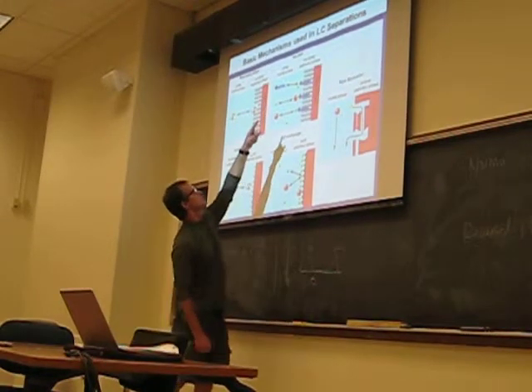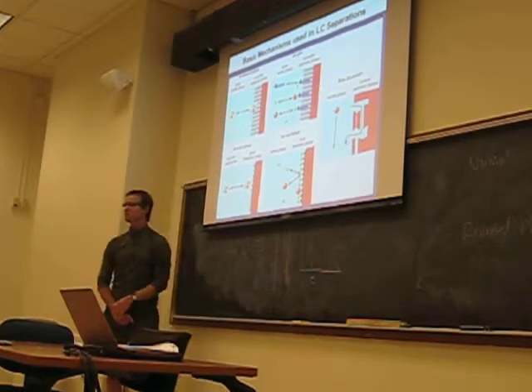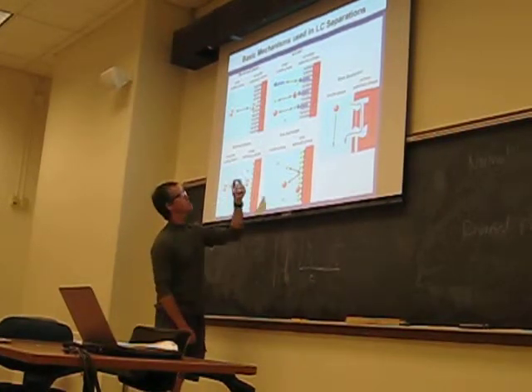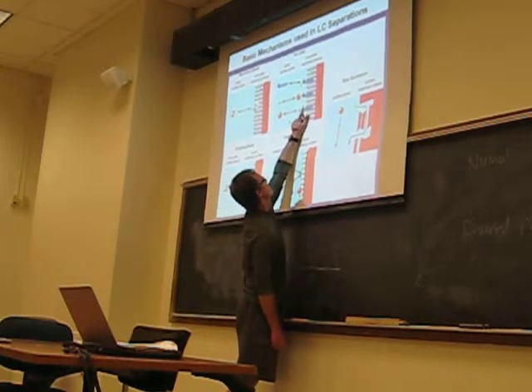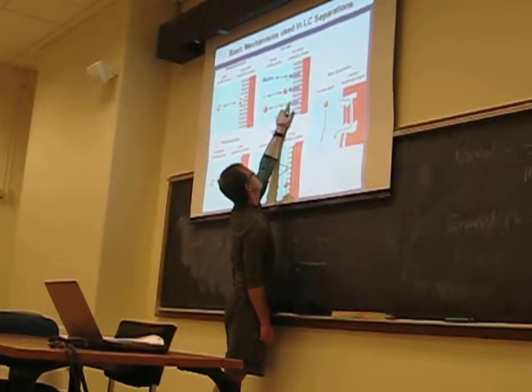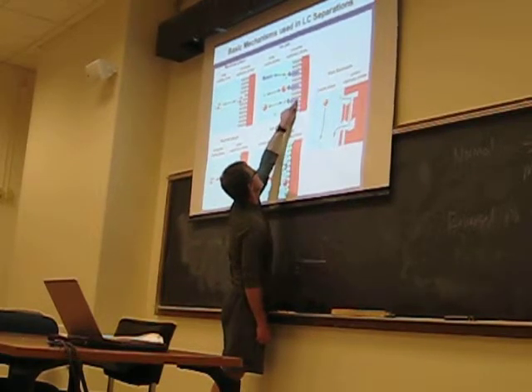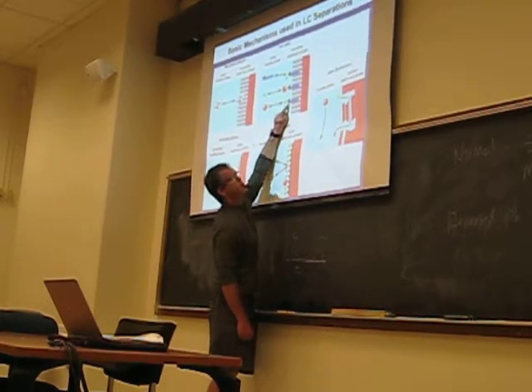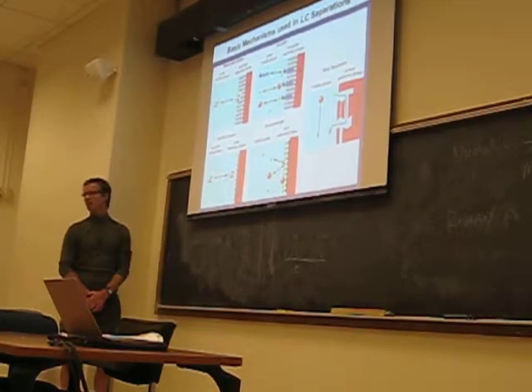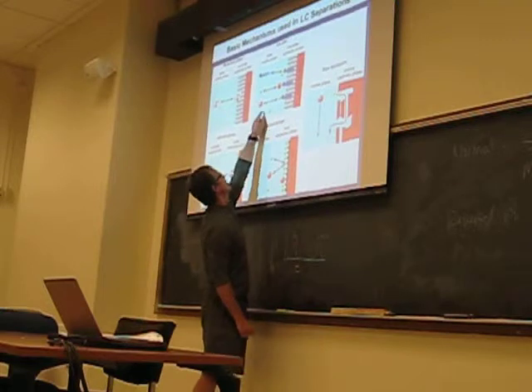They do that because you introduce in your mobile phase something called an ion pairing agent that varies depending on the anions you're separating. The ion pairing agent does this really interesting chemistry where it has an aliphatic character, with both hydrophobic and hydrophilic character on two ends of the ion pairing agent. It hydrophobically associates with the C8 support in the stationary phase and exposes the, in this example, anionic functional character of the ion pairing agent into the mobile phase space, where it can then interact with the molecules you want.